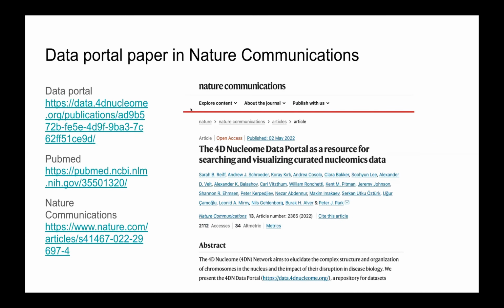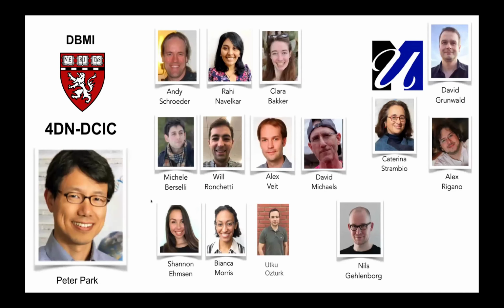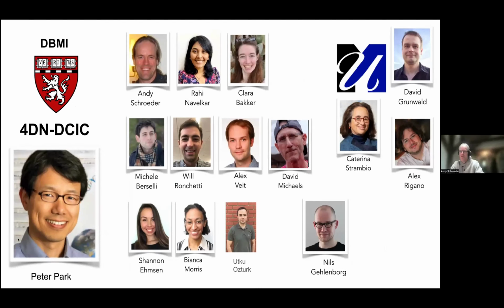To find out more, we have a somewhat recent, a couple of years ago now, data portal paper in Nature Communications. You can find it here. And finally, here's the team that made it happen. This all happens in Dr. Peter Park's lab. There I am.